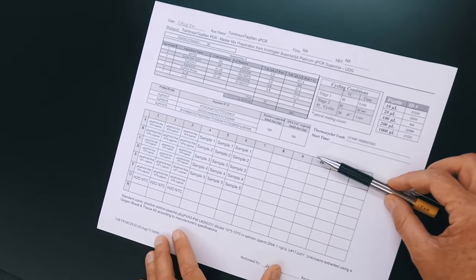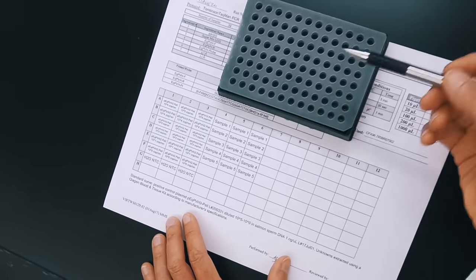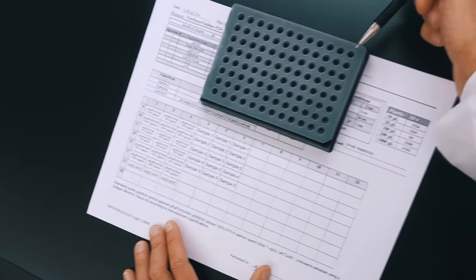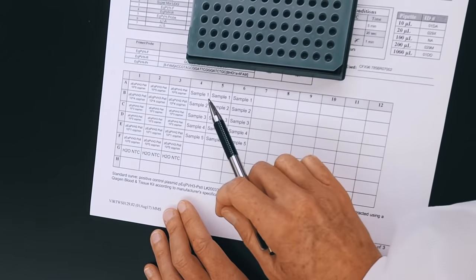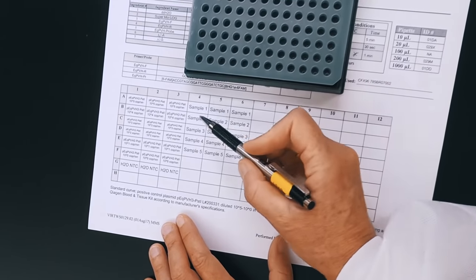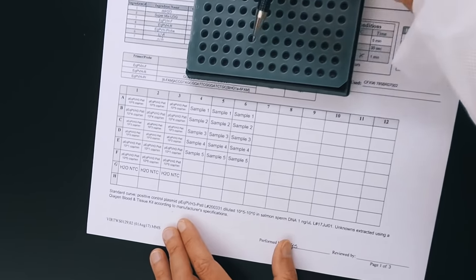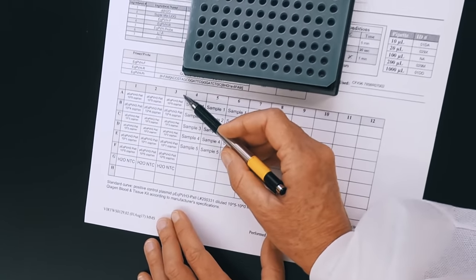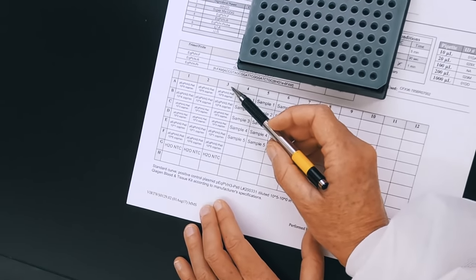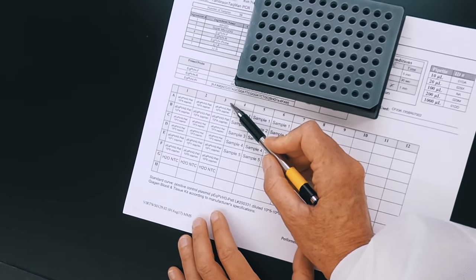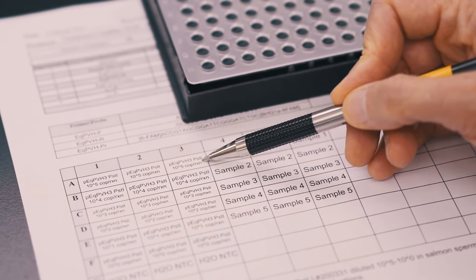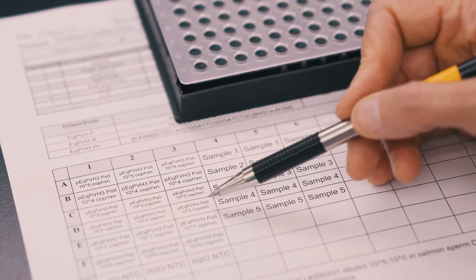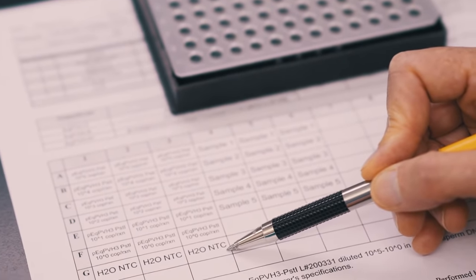This part of the page down here is reminiscent of a microtiter plate. So A through H, 1 through 12. And you can see that all of our samples are going to be performed in triplicate. So we have unknowns, samples number one through five, and they will go into A4, A5, A6, and on down. Columns one, two, and three are reserved for our standards. We make a standard curve by doing a dilution series of a plasmid with known quantities. So we have a plasmid that is 10 to the 5 copies per reaction, a plasmid that is 10 to the 4 copies, 3, 2, 1, and then we will also include a water negative control.